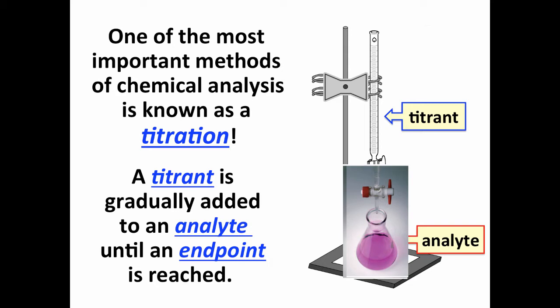This is actually an acid-base titration using an indicator called phenolphthalein that's colorless in acidic solution and a pinkish-purple in basic solution. At the endpoint, more properly referred to as an equivalence point, we've added enough base to fully neutralize the acid.